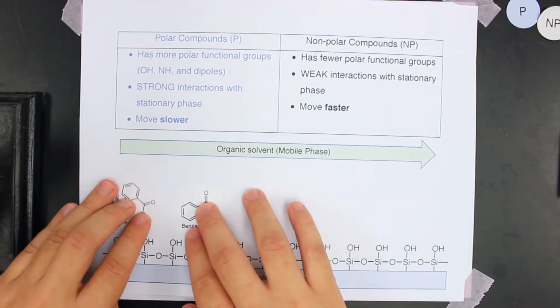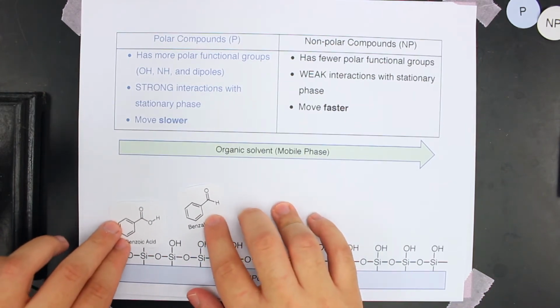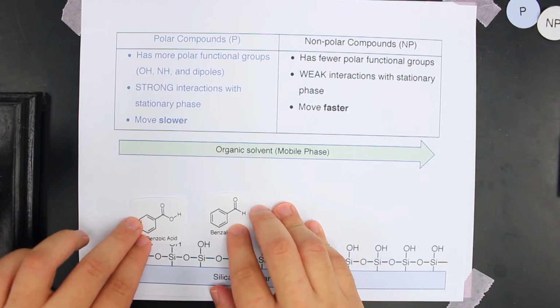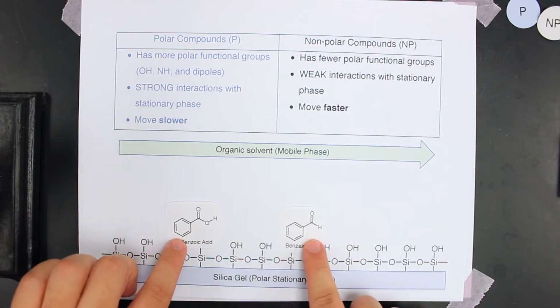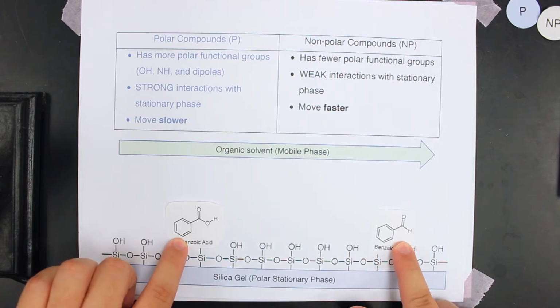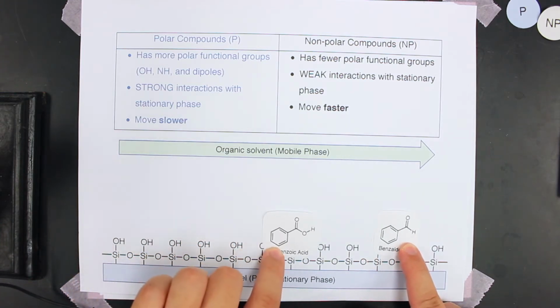So what will end up happening is the benzoic acid molecule is attracted to these OH groups much more strongly and will want to stick to it much more readily than the benzaldehyde. And eventually the benzaldehyde will move faster and faster, whereas the benzoic acid will be constantly tugging on these OH groups and they'll separate.